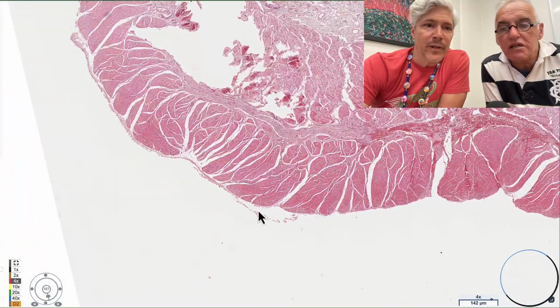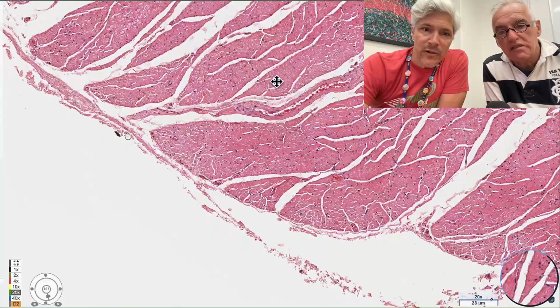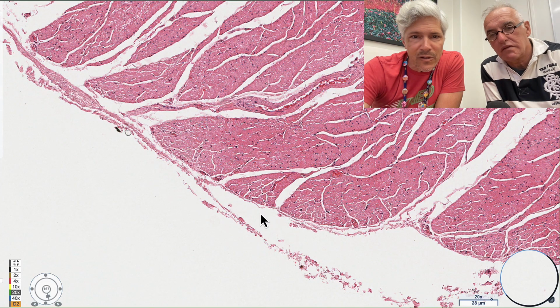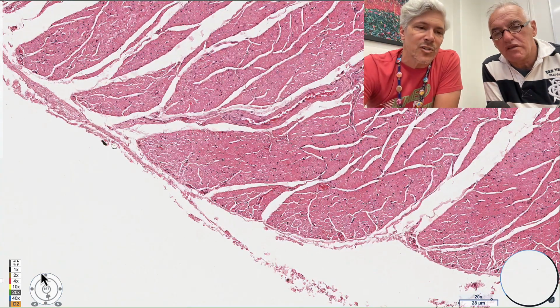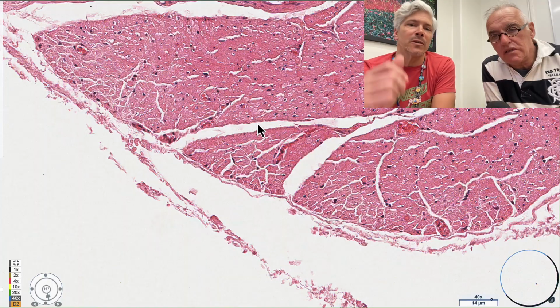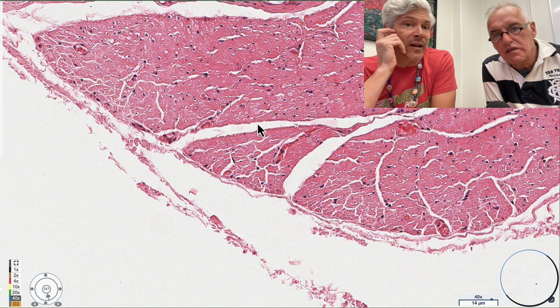And then here, are we going to look for the fourth layer? Just now, look for the fourth layer, which is the serosa. Okay, so we got to drop down below our muscularis externa, and we're looking for ultimately a very thin, potentially a monolayer of cells that would form the adventitia. The adventitia would be connective tissue. If we actually had a serosal layer, that would evidence itself in the form of a monolayer of mesothelial cells. I'm not sure for the esophagus, depending on exactly where we are, it would probably be adventitia.